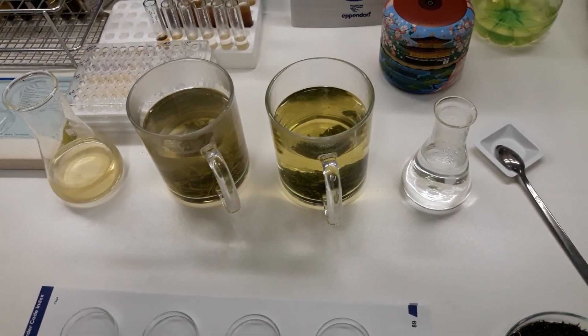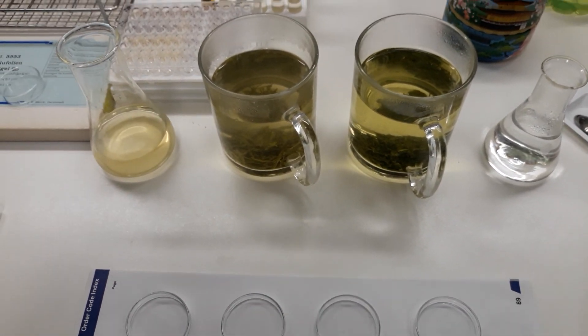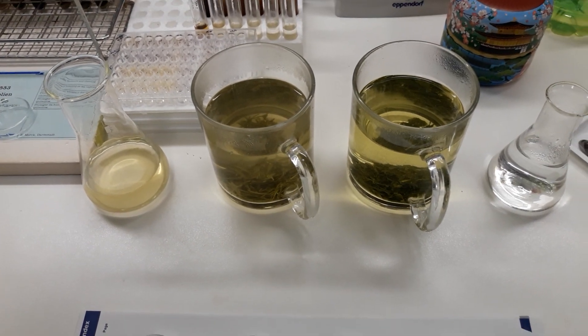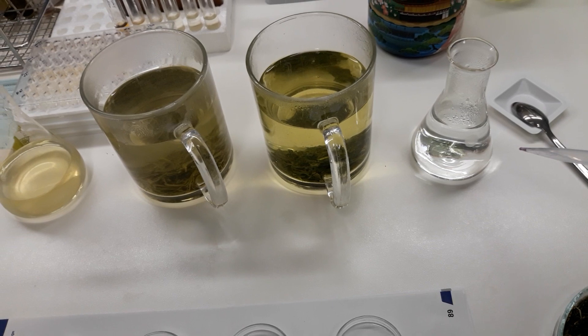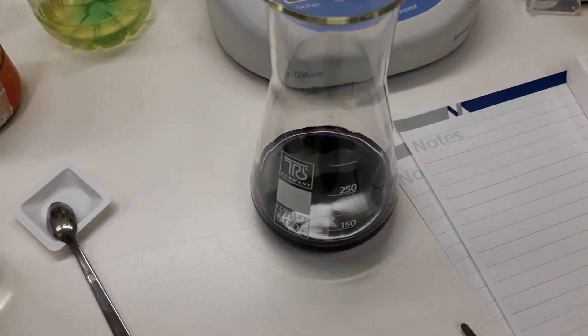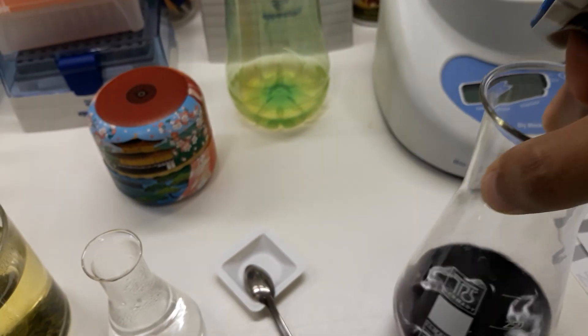It's around 4 to 5 minutes that I've been brewing my green teas. Now I have another sample here, which is this bottled iced tea — I think it's from Coca-Cola — and I also have some of the same water I used to make my teas. And here I have a purple colored material which is called DPPH.